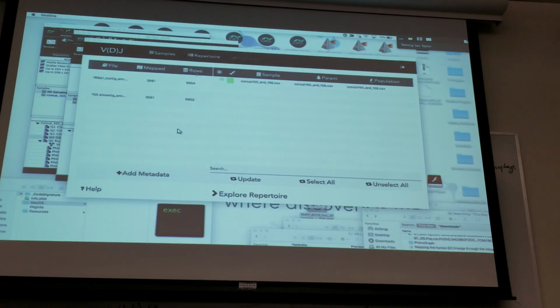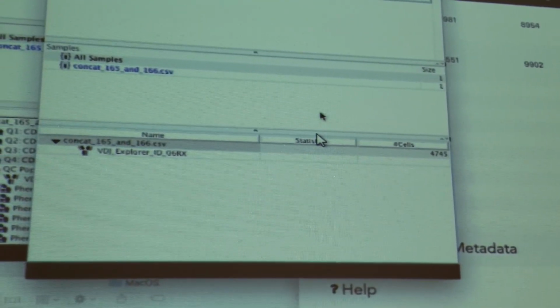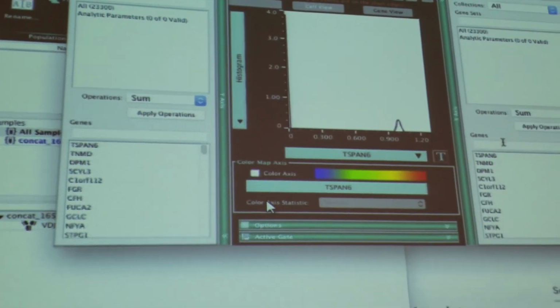Okay, so these are the two pieces of meta information coming from the two concatenated files. And currently I can see that it's working because a huge number of the barcodes found in those two pieces of meta information were mapped. Okay. So this is what you want to see, although ideally with some subpopulations with which to make comparisons. Because without those subpopulations, it's a little bit meaningless. So for example, let's see if I can manage to get a couple of subpopulations in there and map well. And specifically, you might be interested in the two samples, right? Yeah.